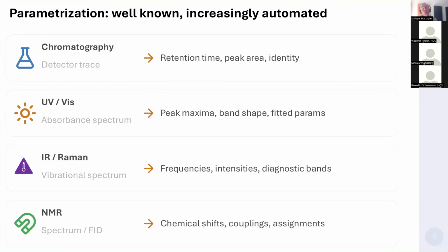You can, of course, always keep, for example, a full spectrum, as I've shown before. But instead of keeping this full spectrum, it has always been the case that people already looked at information that is in the spectrum and keep only that specific information. And let's say in IR, it's pretty clear where you keep like the oscillation frequencies, or in NMR, where you keep chemical shifts.